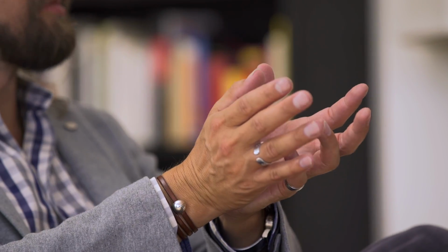Speaking to that, you're not limited to one technique or another. You've got an interest in lipidomics. So how do you stay ahead in terms of choosing the right technology? Because that's a big part of what you do. You're at the very cutting edge of what's possible. How do you ensure that you stay at that cutting edge? We follow the technical developments in chromatography and mass spectrometry because we regularly attend all these top conferences, and we just focus on front-end instrumentation.